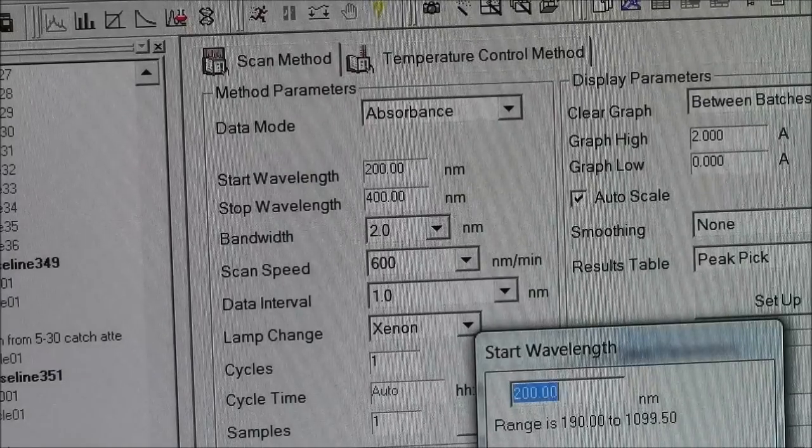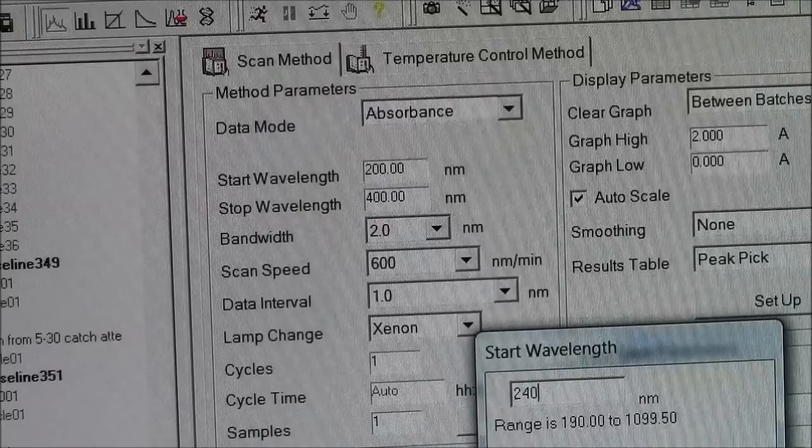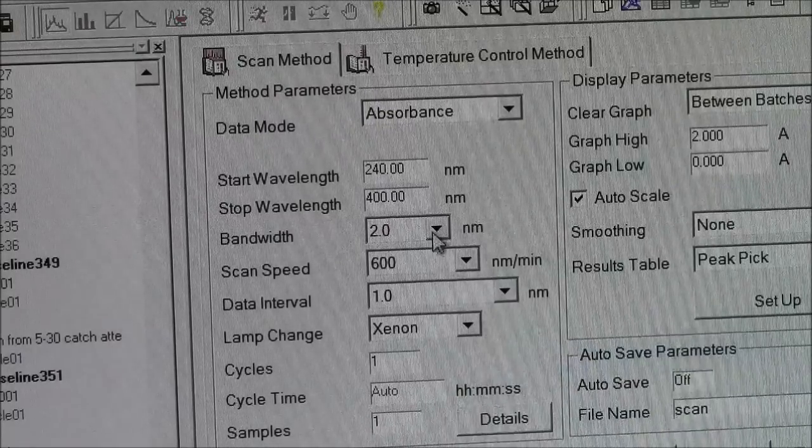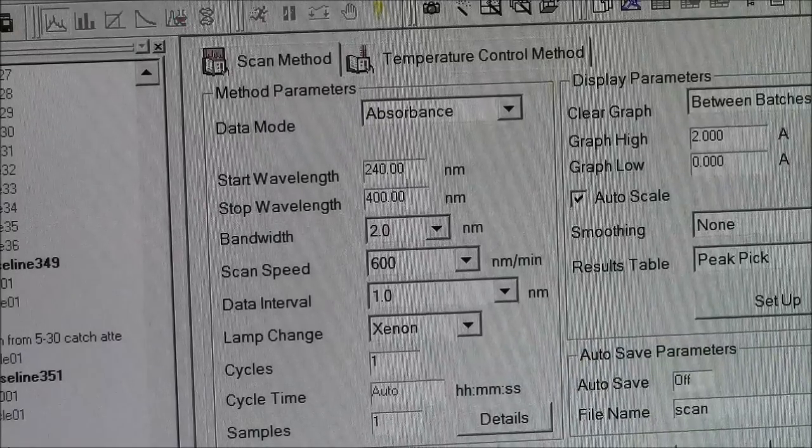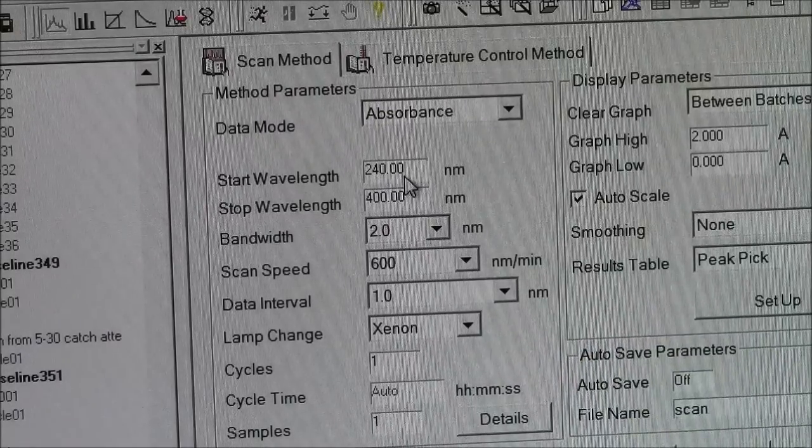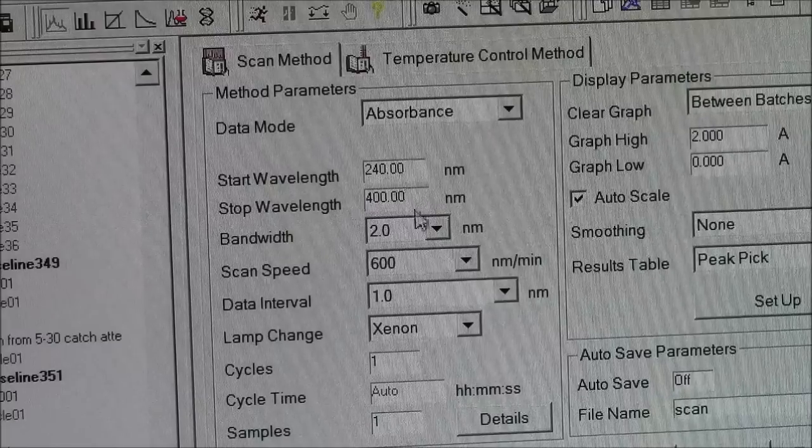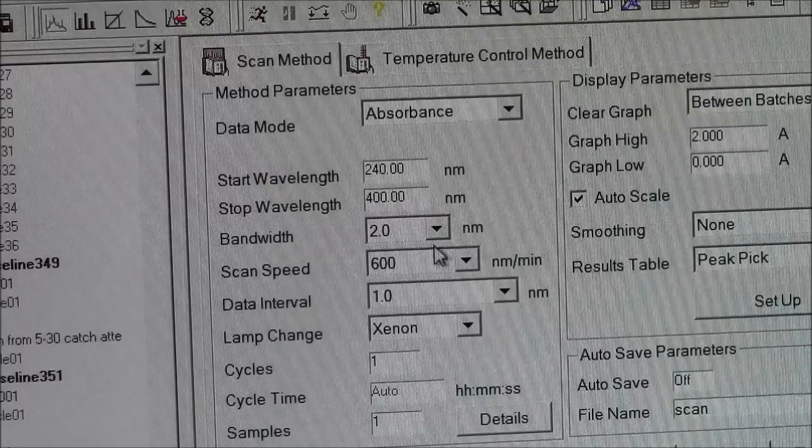If you wanted to say 240 nanometers as the starting wavelength, that's how you do it. You have a starting wavelength, stop wavelength, so it will scan between these two wavelengths. These you don't touch.